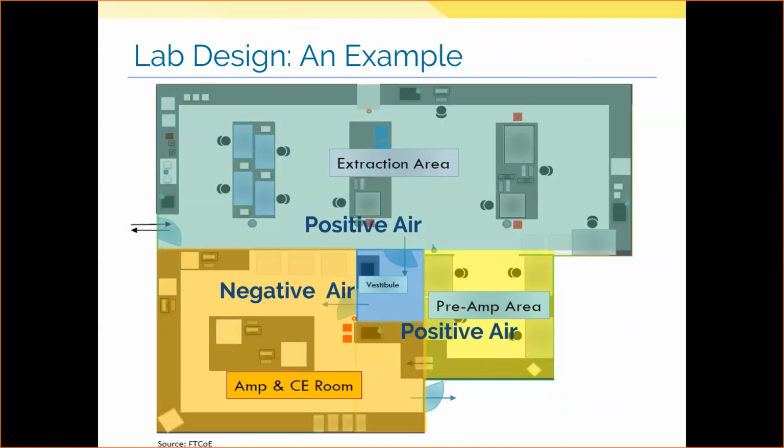I wanted to show you what the lab looked like, and I wanted to show you some of the airflow considerations. Because I'm going to be honest, most of you probably have never stepped foot into the lab. And if you do, you probably had to submit your own DNA, right? Because there's no real reason for a multidisciplinary team member to actually be in that true processing area of the laboratory. It could throw chain of custody concerns into the mix with a savvy defense attorney. So for some of you, this might be your first time looking at what an ideal lab design looks like in terms of the airflow and in terms of the space that we need.